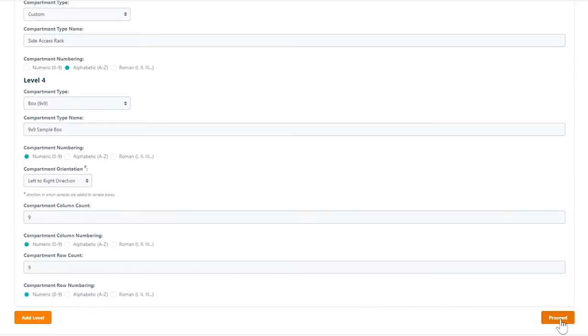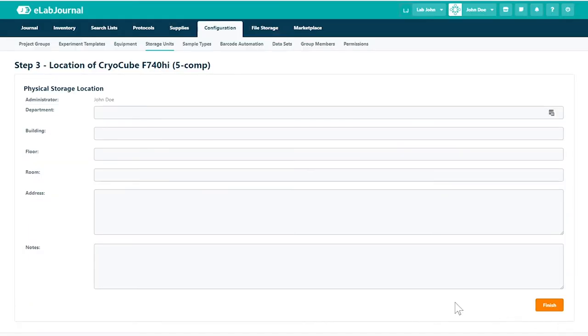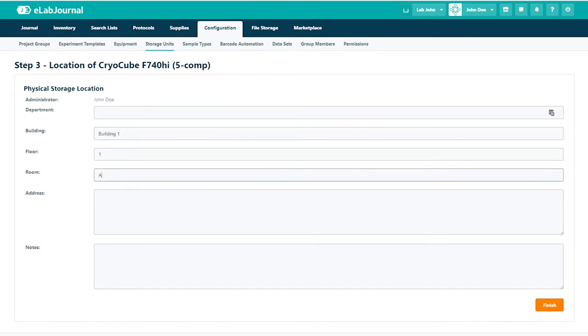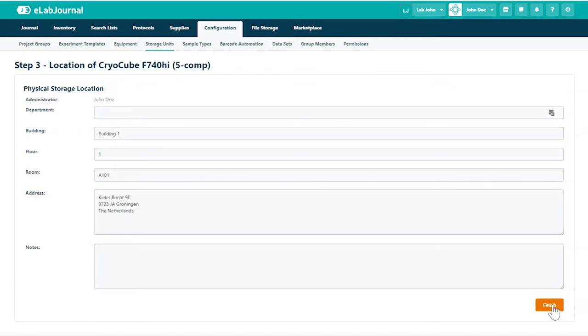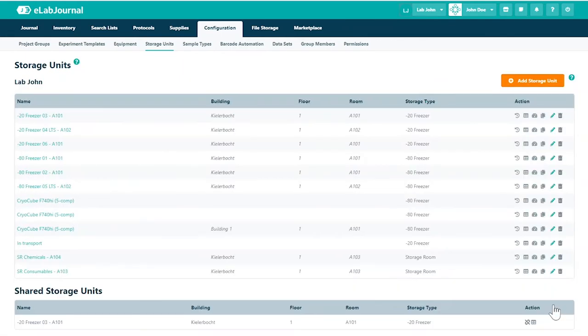Once you have completed the storage unit compartment configuration, you may proceed. In the final configuration step, specify the physical location of the storage unit. Click finish to create the storage unit.